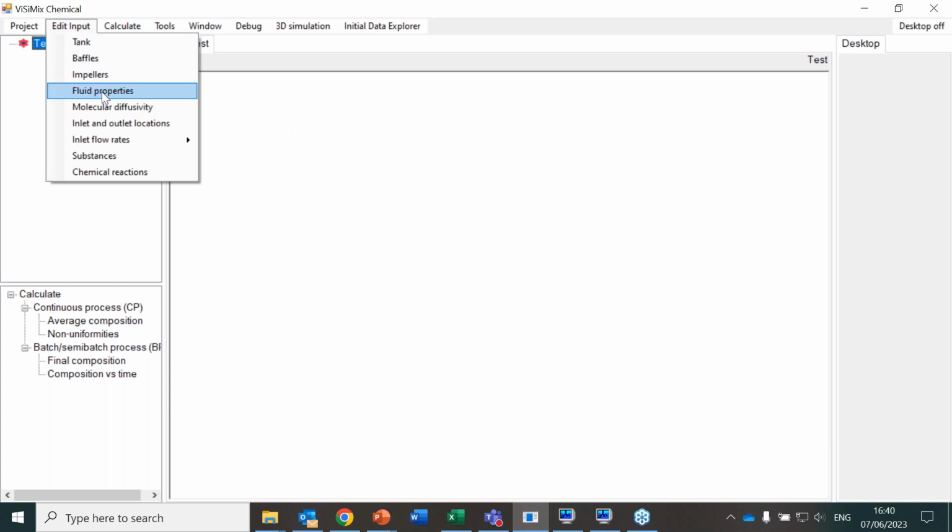Now, if we come to understand the mixing part better, in order for the process to progress, we need to bring two materials together. Yes, we have A and B, and the opposite, we have B and B that will generate an impurity. But any reaction will occur when two molecules are in proximity and meet one another. For this, part of the way that we are able to calculate the actual mass transfer in the tank is that we need the molecular diffusivity of the materials.